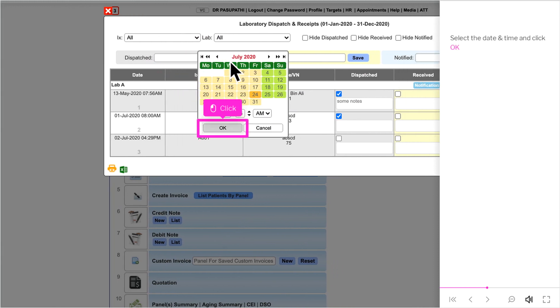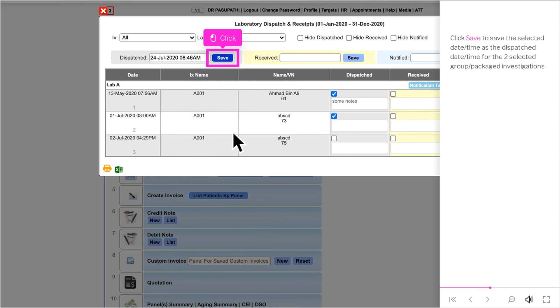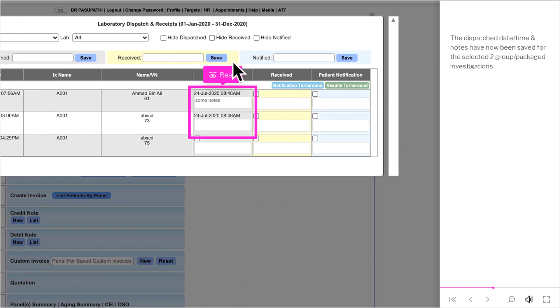Select the date and time and click OK. Click Save to save the selected date and time as the dispatch date and time for the two selected group or packaged investigations. The dispatch date, time, and notes have now been saved.